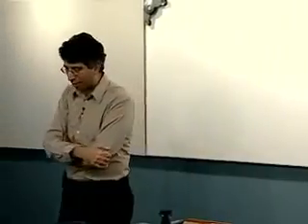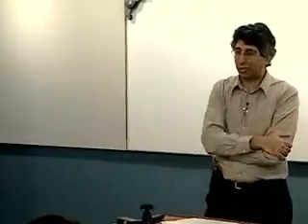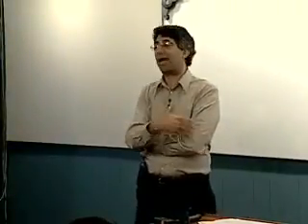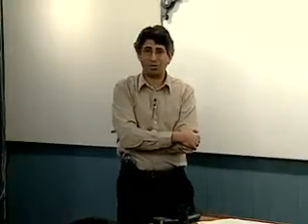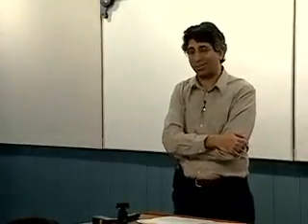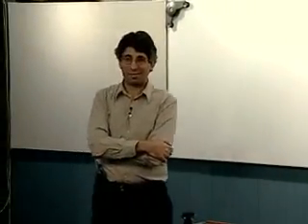So we're gonna get serious today. When I started the course, I told you that one of the concerns you have as an electrochemist is that unlike other sorts of analytical chemistry, such as spectroscopy, when you take your electrochemical cell and you attach it to your potentiostat, you've modified the circuitry of the potentiostat, and so you have to be certain about what you're doing, or you're going to get some pretty exciting but unrealistic results, which is not all that uncommon, actually, unfortunately. So what we need to do is build a potentiostat so we understand what makes it tick.